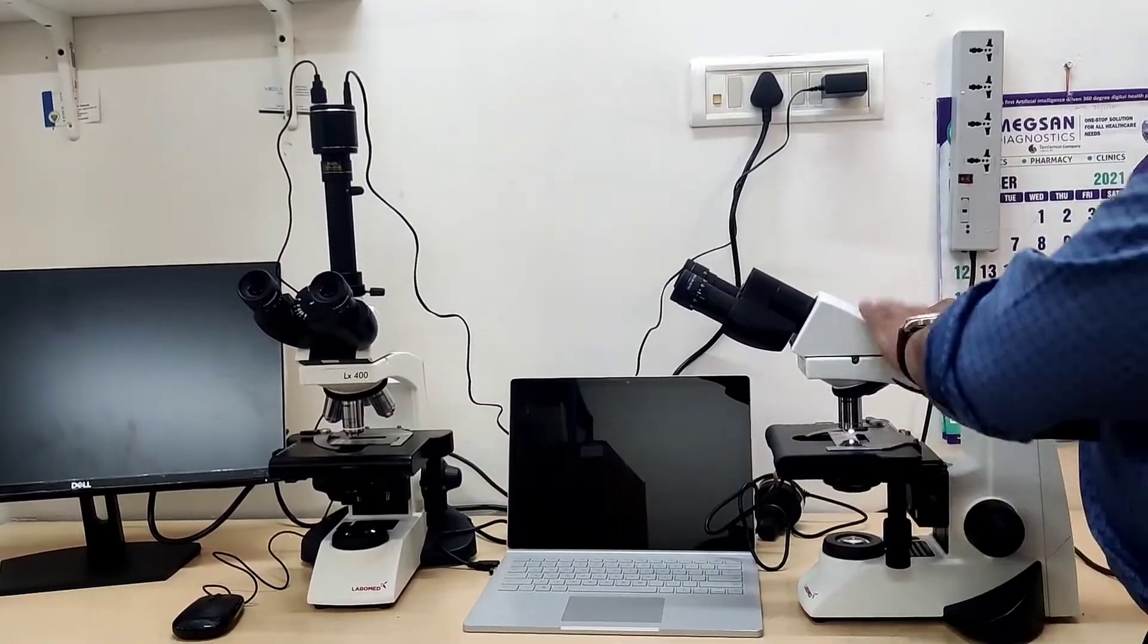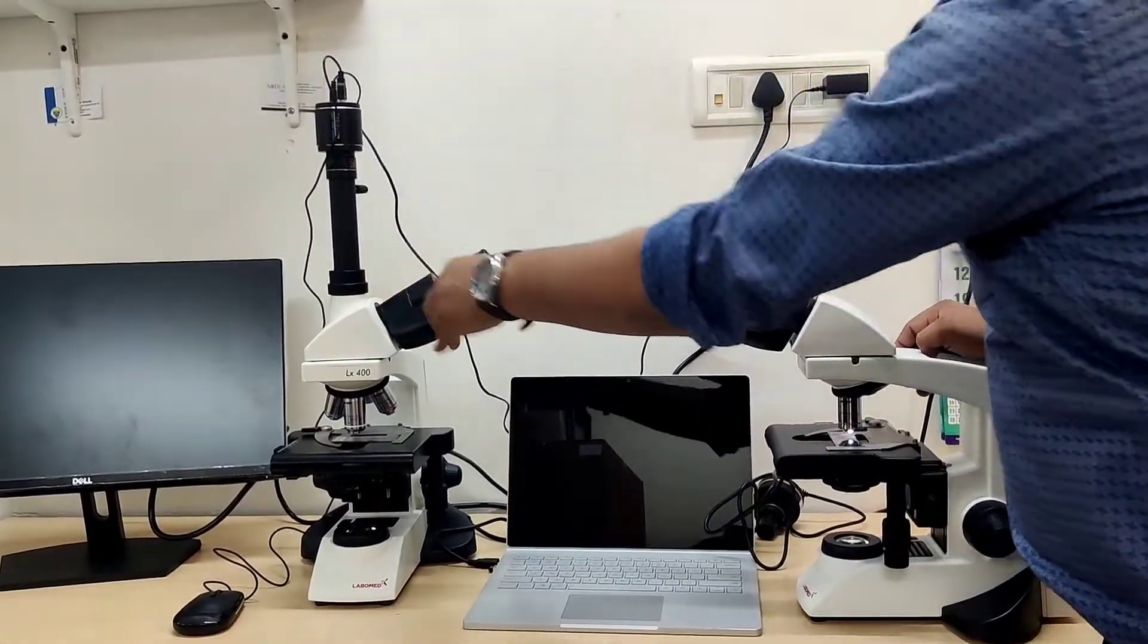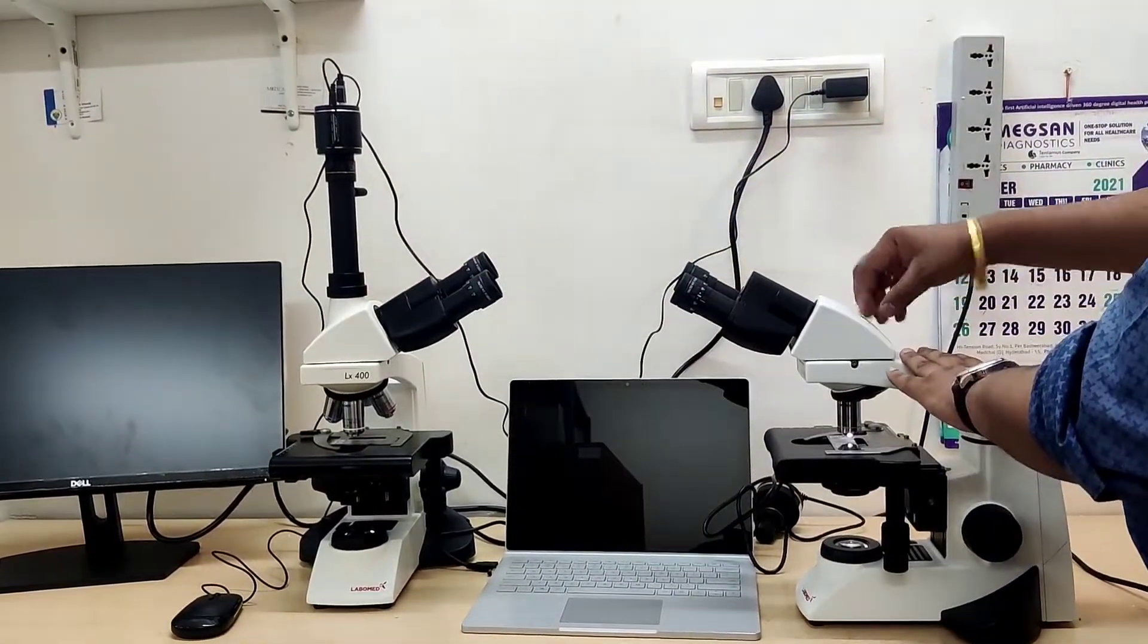Now people ask me what is the difference between a Binocular and a Trinocular. As you can see, this is a Binocular. Here you don't get a third port.